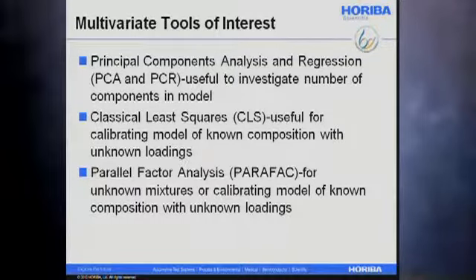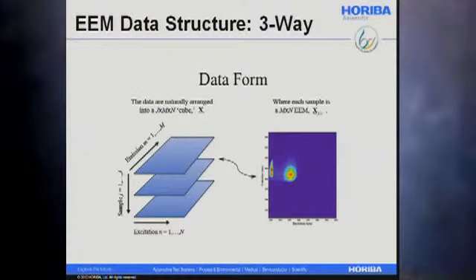Parallel factor analysis is another key thing that I wanted to focus on here, because there's been very high correlations shown between the components that are extracted with parafac analysis. You're familiar with the three-dimensional excitation and emission spectra that I've shown here several times, but there was a special three-dimensional multivariate tool developed to separate these.